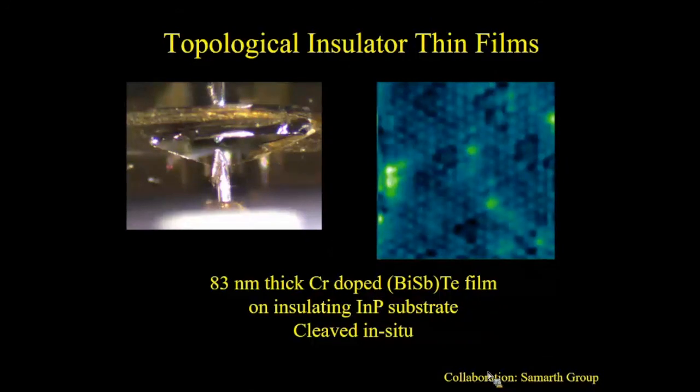Then we just need to place the tip right close to the edge of the sample, so that we were far away from any regions that are damaged from the post going off, and any region where the conducting epoxy is making a mess on the top surface of the material. And with that, we're able to get atomic resolution. These are individual chromium dopants in this bismuth telluride film, and we're beginning to investigate that.